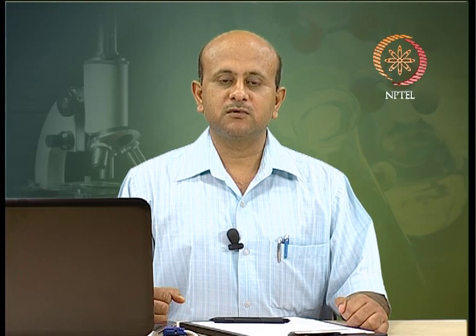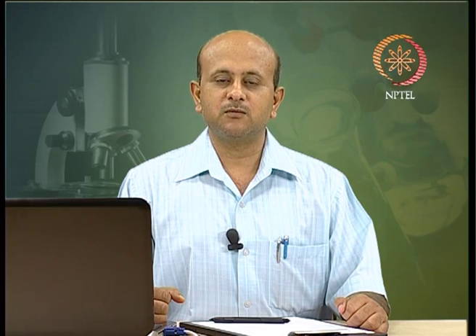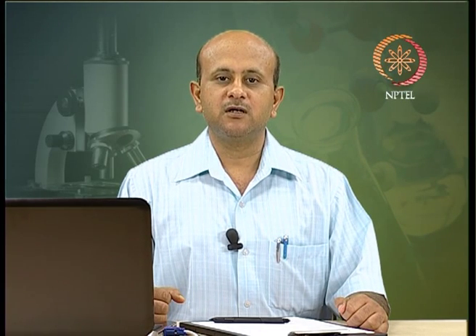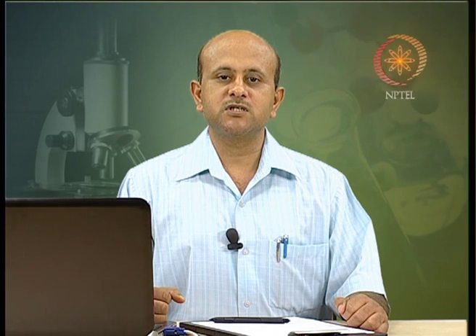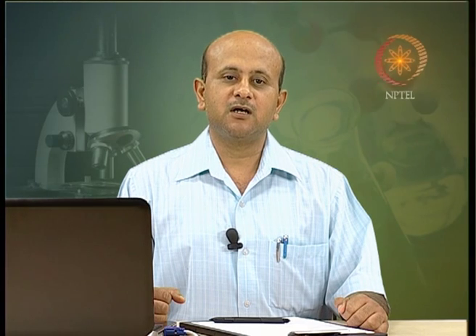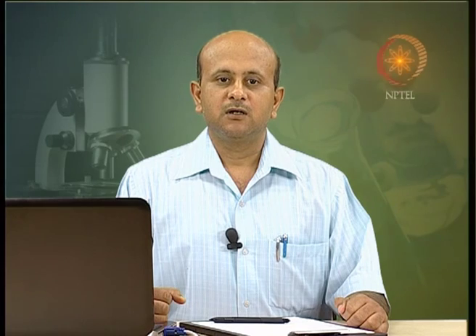One is the preparative ultracentrifuge and the other is the analytical ultracentrifuge. So, let us start with the preparative ultracentrifuge. In a preparative ultracentrifuge, the maximum rotor speed could go up to around 80,000 revolutions per minute, or maybe more. It can go even much higher in bench top ultracentrifuges, like 150,000 revolutions per minute, generating an RCF value of say 600,000 g. So, this is for floor models.